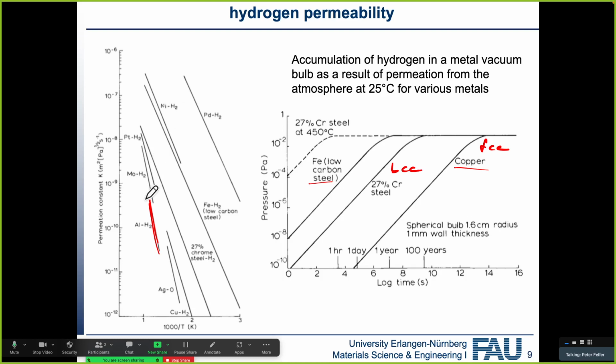The reason why I put that slide on is because the general wisdom was, and to an extent is, that some of the hydrogen that goes into the chamber diffuses through the chamber wall into the vacuum. This is not something that we can really confirm, because our experience, especially with ultra clean vacuum systems, is that this doesn't necessarily happen, and probably the contamination mostly comes from the dissolved hydrogen in the metals themselves.